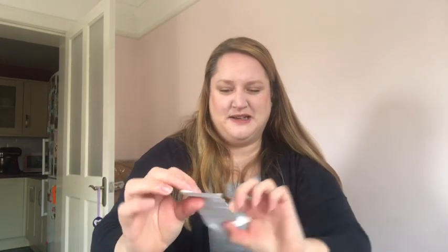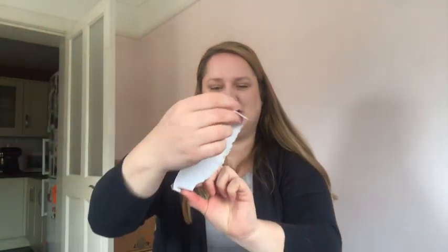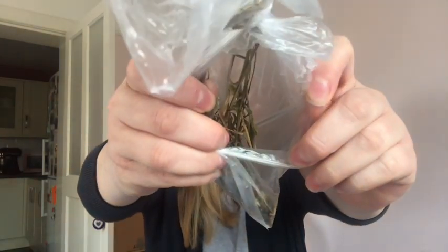Box D collected this when we went out on the Tuesday, and they've put some beautiful labels in here. So I'm going to open this one up. It's been sat in my dining room since then, hoping it's not too smelly. So that is sand sample 5. It's a little bit dry. There's not much in there at all really, just some veg. If it's a little bit dry, we're going to need to add some water to the mix.